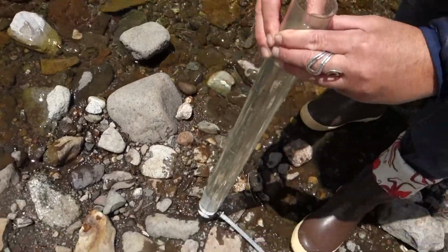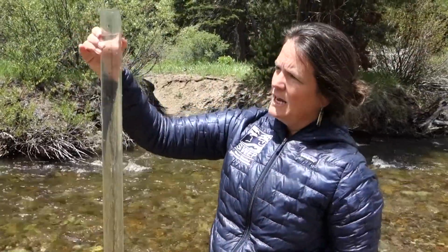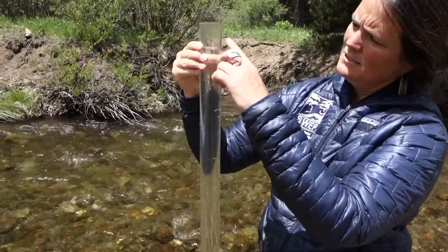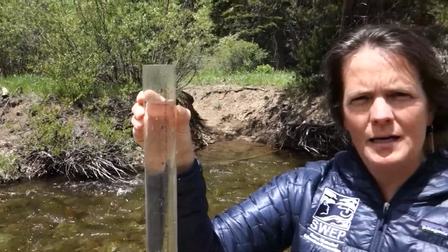If I can see the black and white checked plate, then I'm gonna say that the water's pretty clear and I have greater than 60 centimeters of clarity in this creek. So I'm gonna just note down on my data sheet, greater than 60 centimeters.